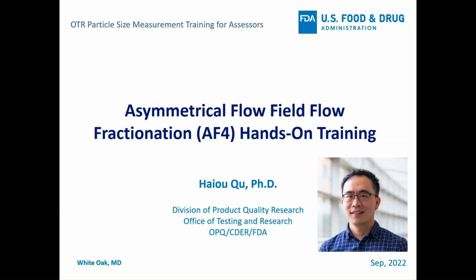So this AF4 technique is a very advanced separation and characterization technique. It's a relatively new technique compared to HPLC, but there's an increasing use for the analysis of nanoparticle and polymer material in the past decade.